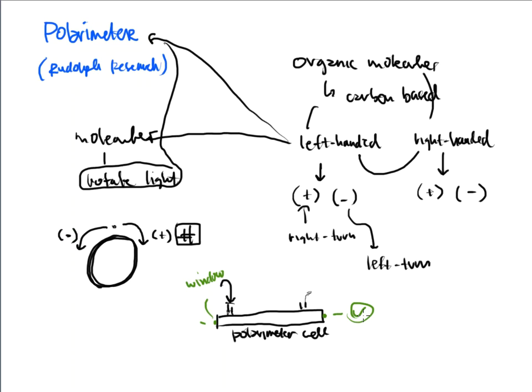Okay? The problem is that if you don't load the polarimeter cell the proper way, you can create air bubbles. We saw that air bubbles were bad in the density meter. Air bubbles are going to be bad again here. Those air bubbles will take up space and create an air pocket in the polarimeter cell, and this will become very cloudy or very vague.